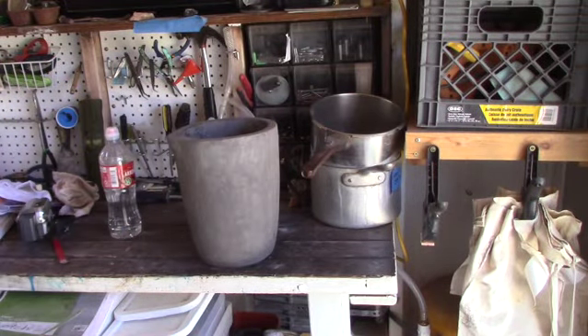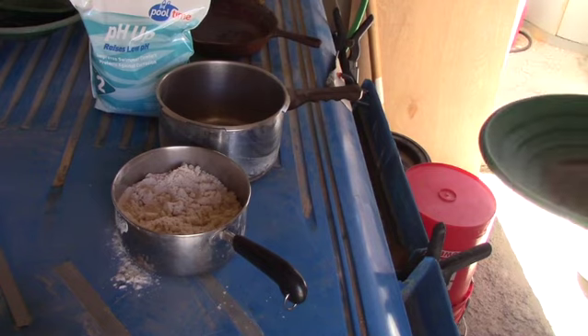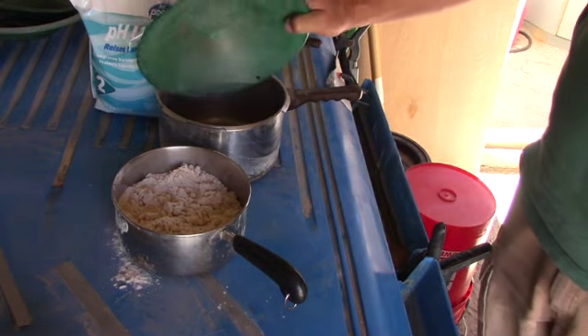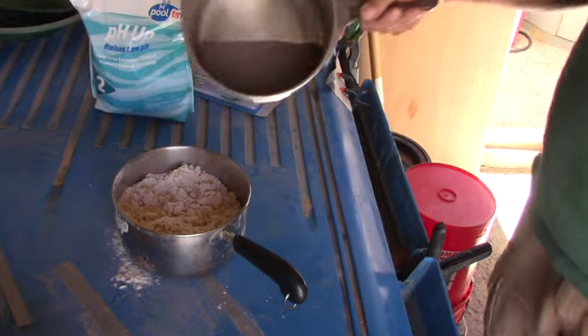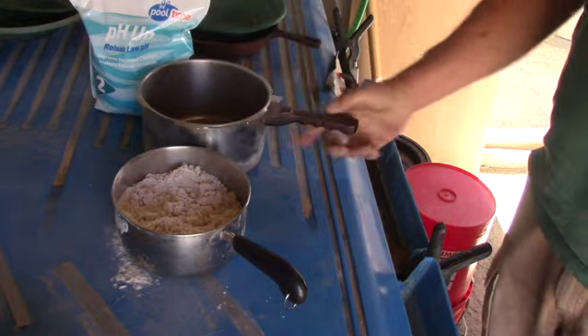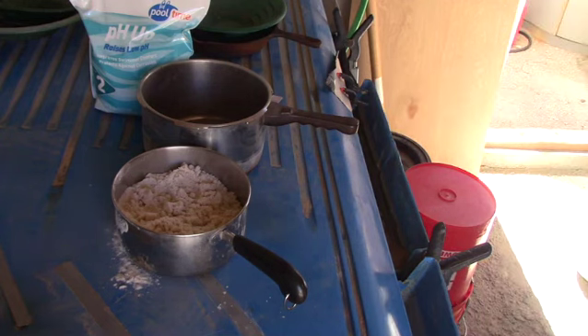We're going to be using this crucible today — it's a brand new one. I don't want any gold contamination in our silver. So we're starting off here with 1,100 grams of ore or concentrates. We'll mix up about 2,000 grams of sodium carbonate and then mix in about 50 grams of silica sand. That'll be our flux.